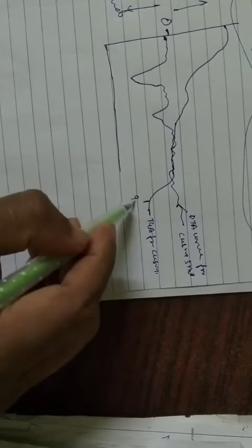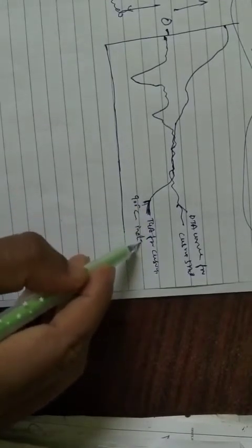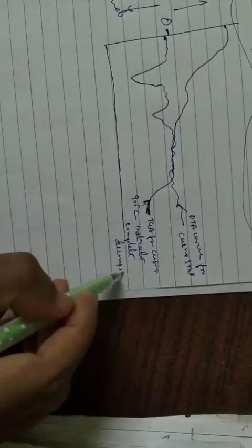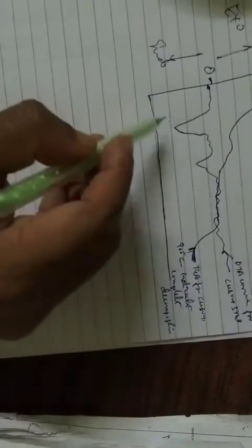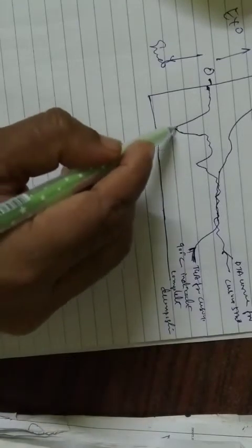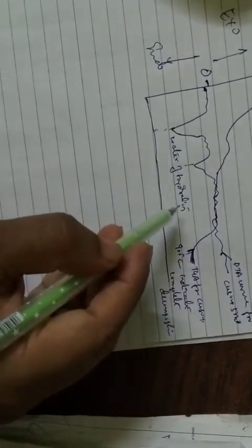So here you can see 900 degrees centigrade I am going to take here, okay. So in this, whatever we are seeing here indicates complete decomposition, complete decomposition above 973 or 900, as in the previous video we have seen for copper sulfate. So we can see the complete decomposition of the copper sulfate here. Now what you are seeing here, two peaks we have observed downward. So this is nothing but your water of hydration. So this is your water of hydration.